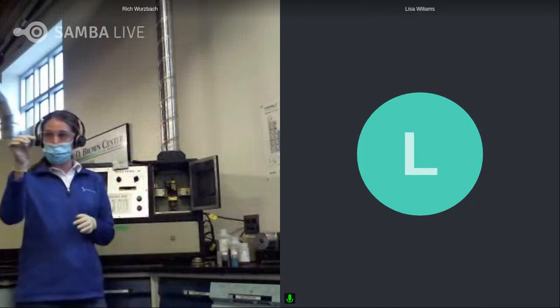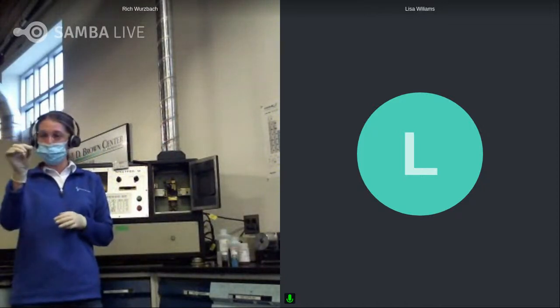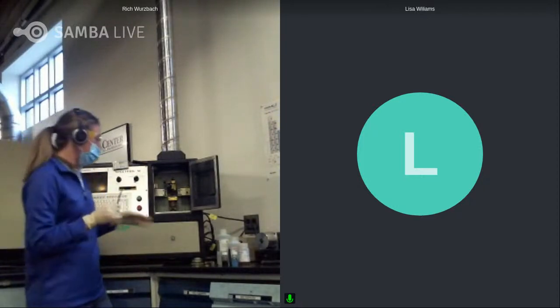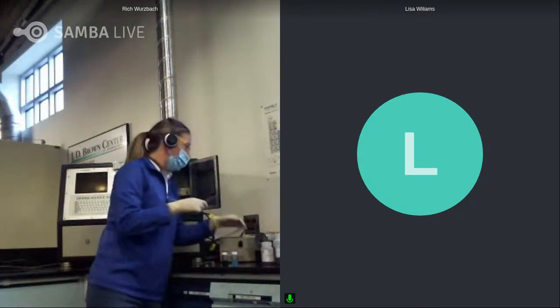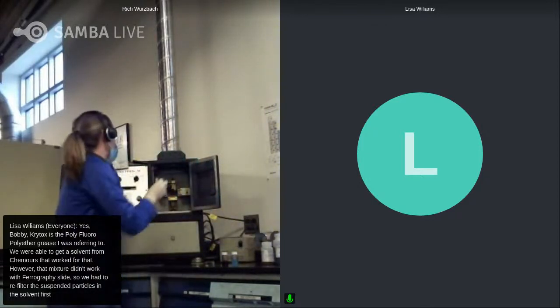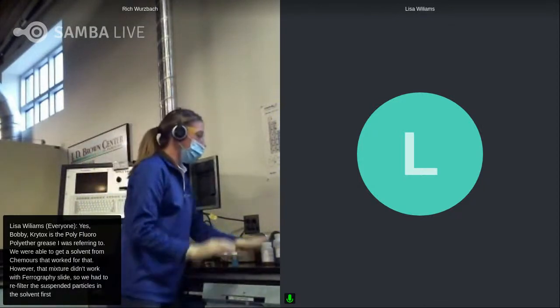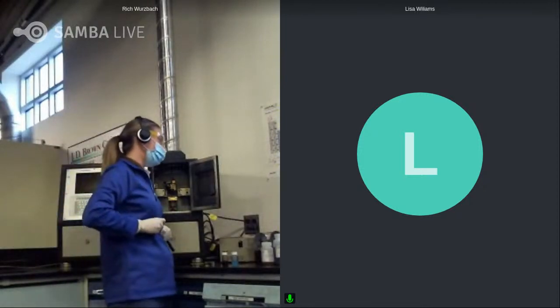You have your rod. Just like with oil analysis, you've got to make sure that it's sharpened and clean, with a nice tip on the end of it, because you're going to create that spark. So I'm going to go ahead and prep the sample. It's exactly as you would do to run oil analysis. You have your sharpener. I'm going to sharpen my rod and put that in. And then you have your carbon disc, again exactly the same as with an oil sample.